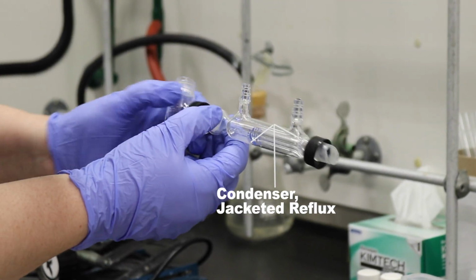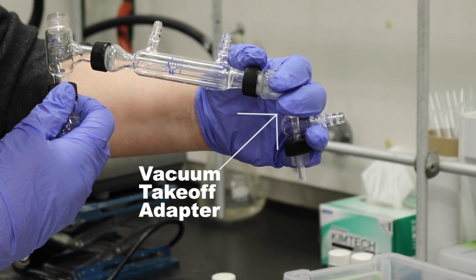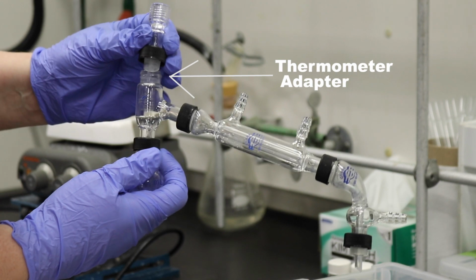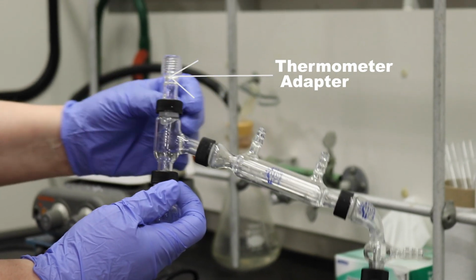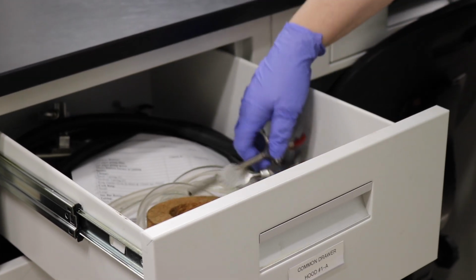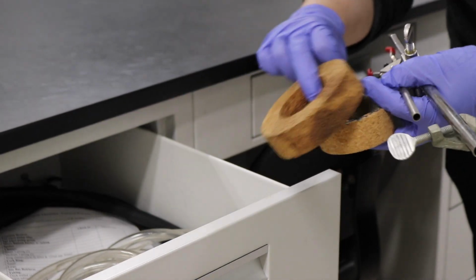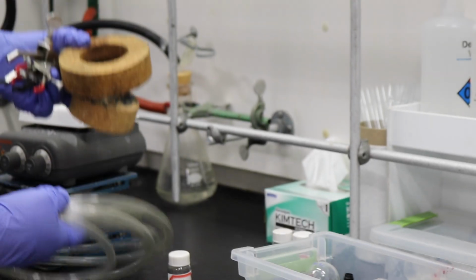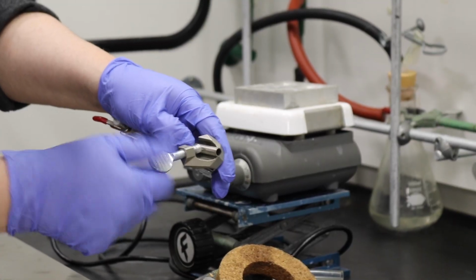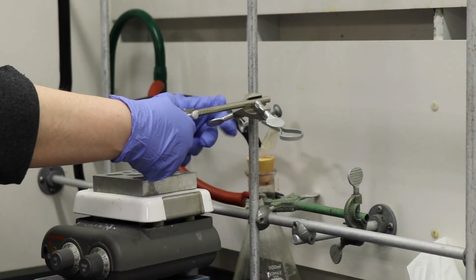Then we're putting on the jacketed condenser, the vacuum takeoff adapter or our bent adapter, and the thermometer adapter. Once that is put together, we basically have our skeleton set up. So we go to our common drawer and take out our clamps, our cork rings, and our thin wall tubing. We're going to clamp the clamps to the back of the hood. These clamps will secure our distillation apparatus.